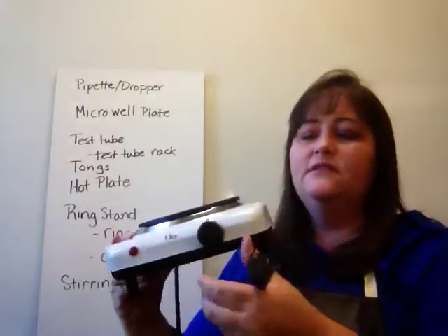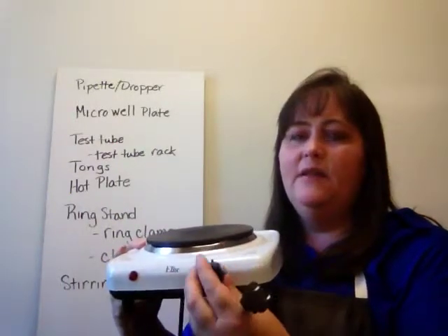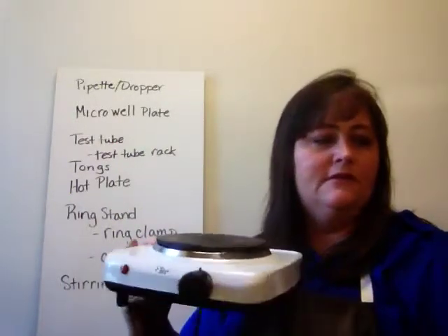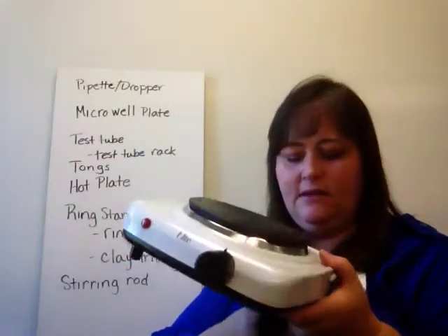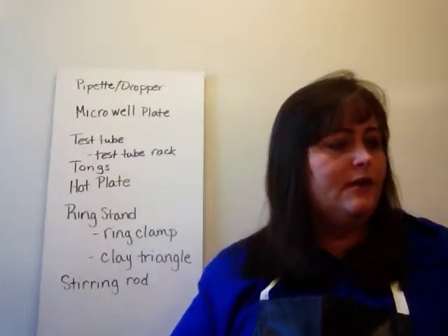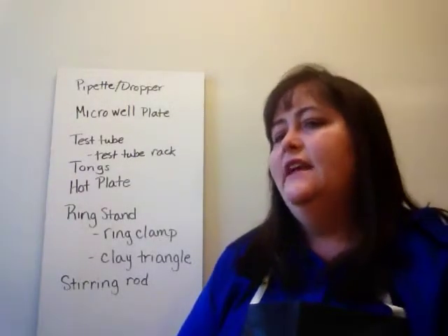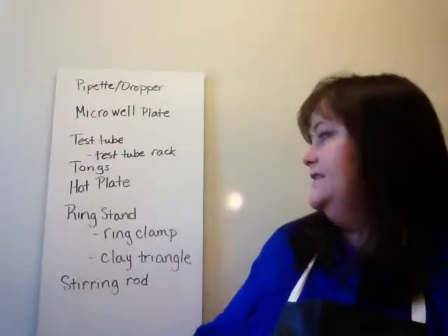All right, and of course, these are controlled just like any old oven or stovetop. High, medium, and low temperatures so that you can adjust how you add heat to a chemical or a material. We will use these once or twice at the beginning of the year and some more later on in the year. The next thing we're going to talk about is the ring stand.